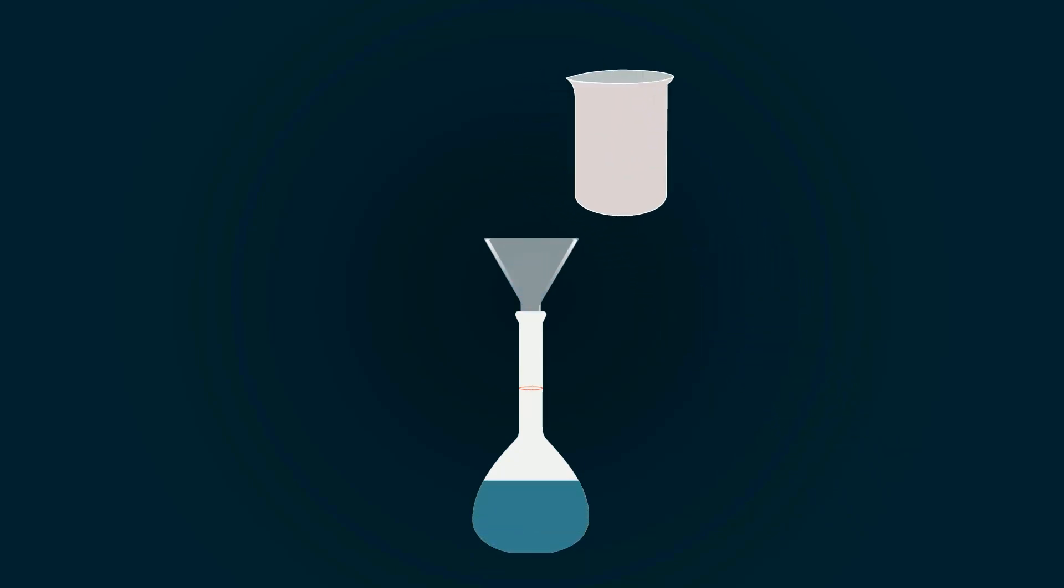Now pour the solution into 1000 ml flask with the help of funnel. We have to fill the flask up to the 1000 ml point.